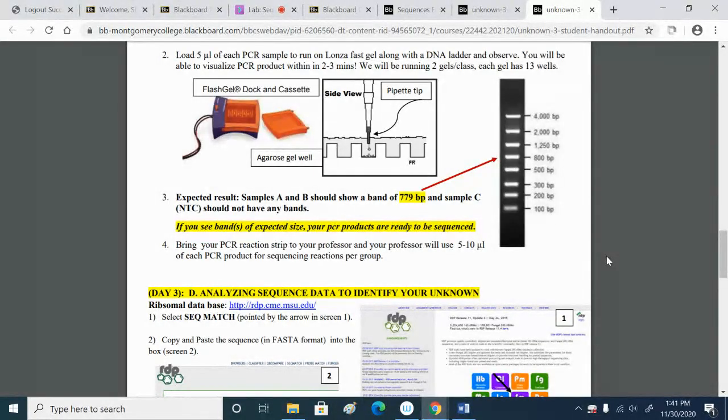So they run them, and the computer scans them, and then they email you the sequence information. So it truly is incredibly fast these days and relatively cheap. I think the last time that I heard, they only charge $5 per sequence, so that's pretty cheap, and especially given that it's so fast.